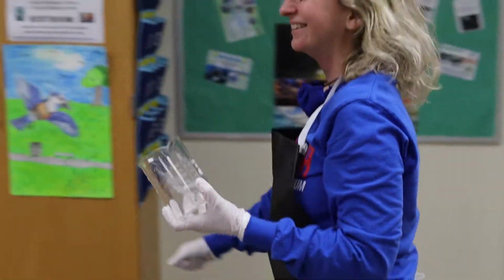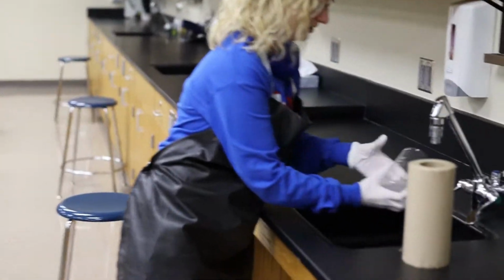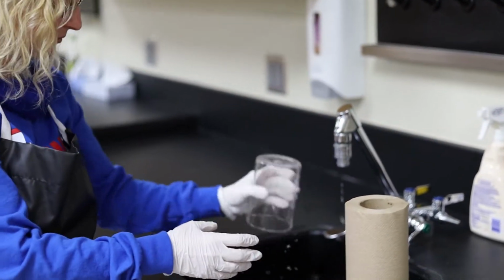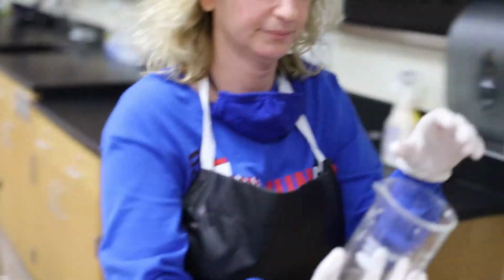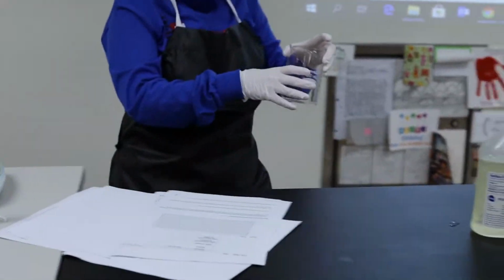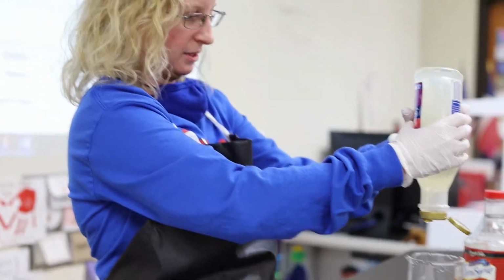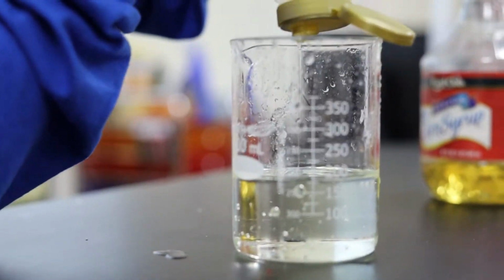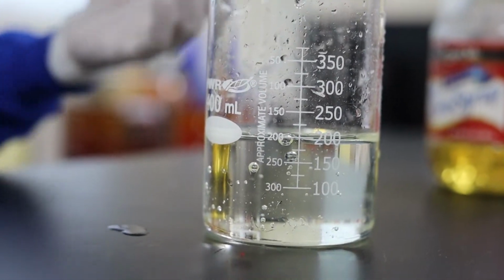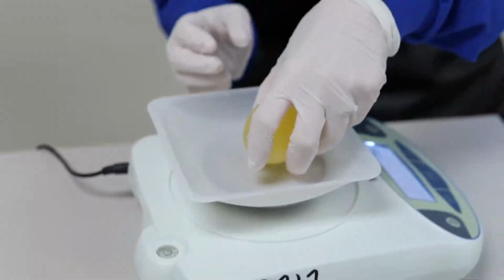Should we get a different one? No, I'm just going to clean it. All right, clean, clean, clean. Good enough. Okay. It's the best cord placement ever. Okay. Now, syrup, 200 milliliters. Yay. Boom. And put our egg into the solution.